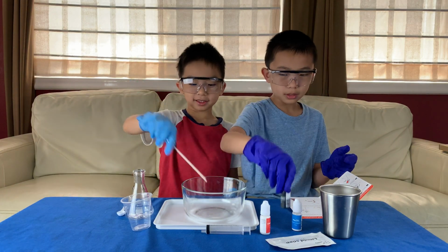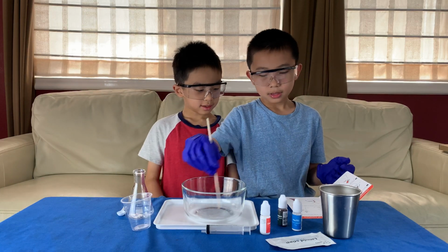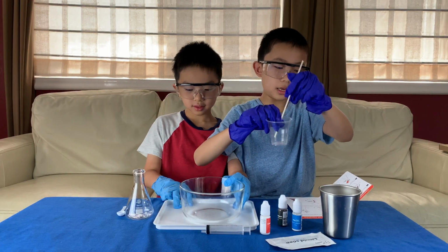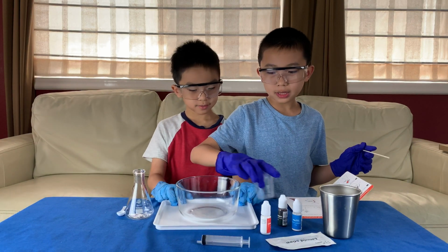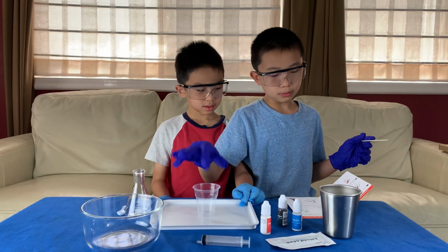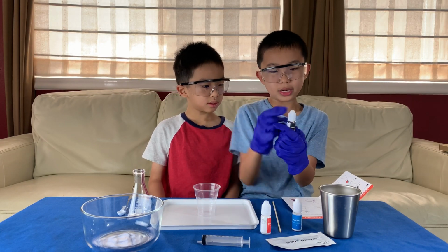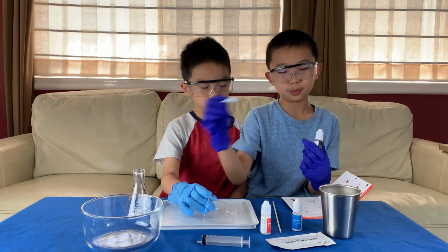And this is to stir. Oh yeah, we have a wooden stick to stir. No, we'll be stirring it in the disposable cup, like this. Okay, we're going to start now. The first thing we need to do is, with the disposable cup, pour the food colorant, the anthocyanin, into it. Oh, no, we have to measure 1 big spoon.